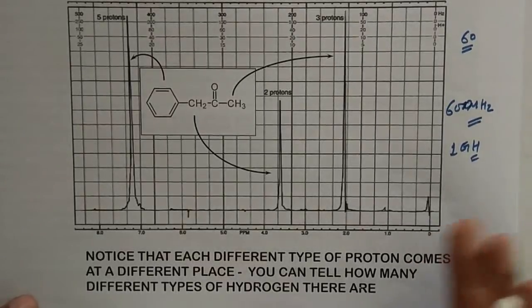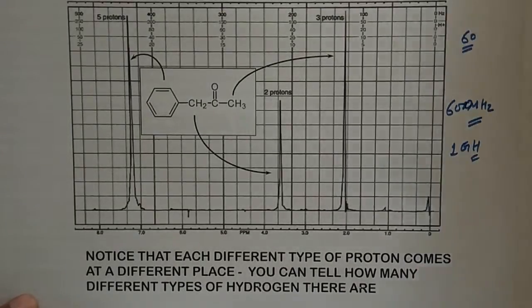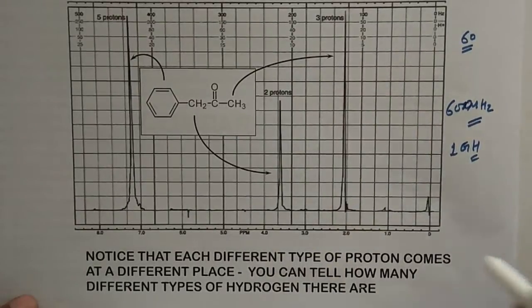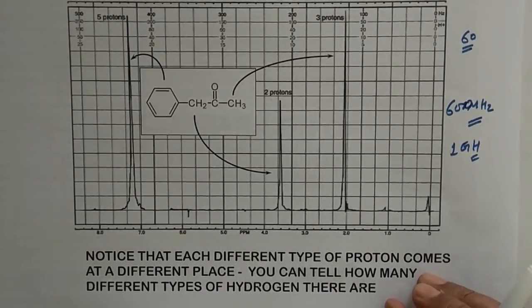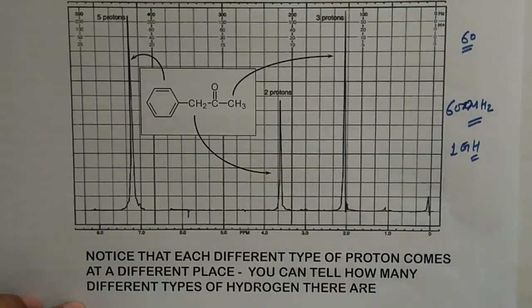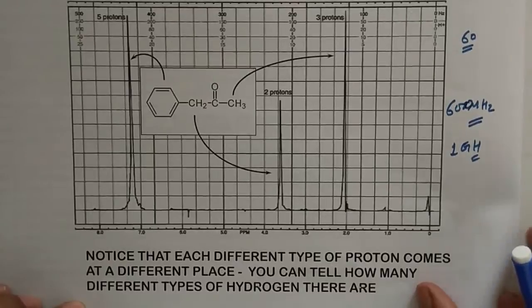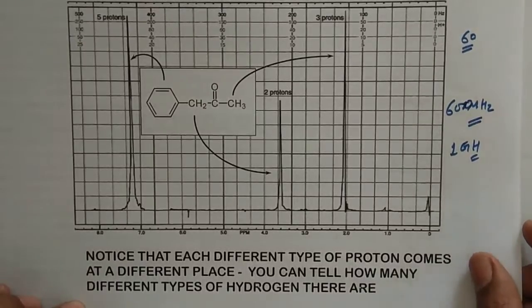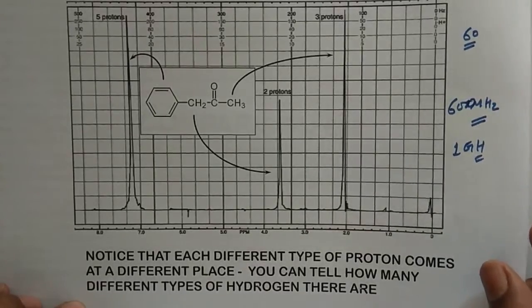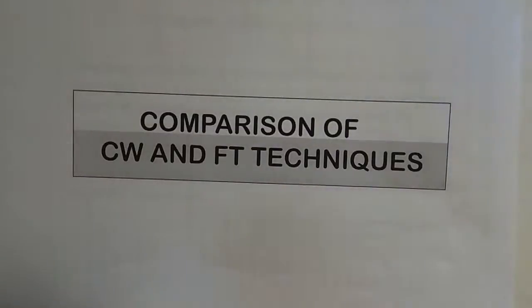So there is no difference in the spectrum. Now people can ask, if there is no difference in the NMR spectrum we get from the CW, that is continuous wave, and the one we get from FT NMR, what is the difference between the two, why are we doing these exercises? One, I already told you, if you increase the magnetic field strength, you will have better sensitivity, better signal. And second, FT NMR takes very little time, because pulsed excitation is used, and the relaxation process and all these things occur very quickly.